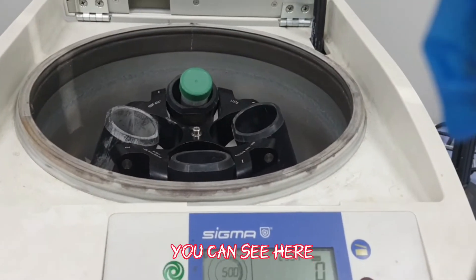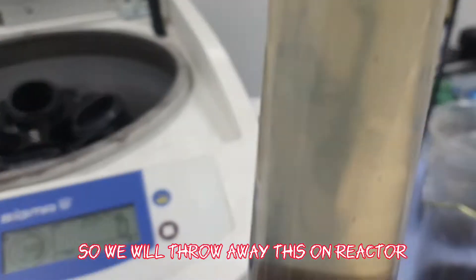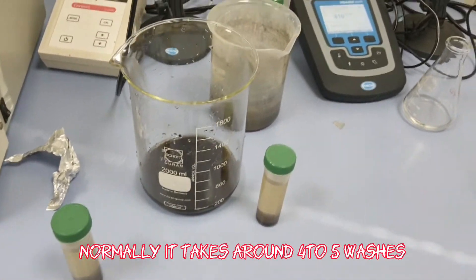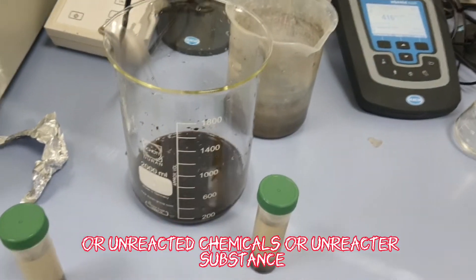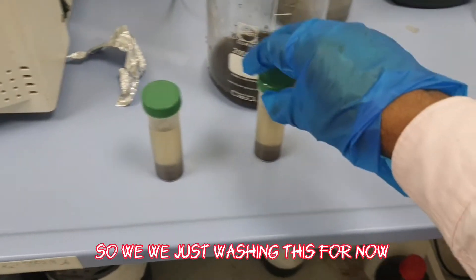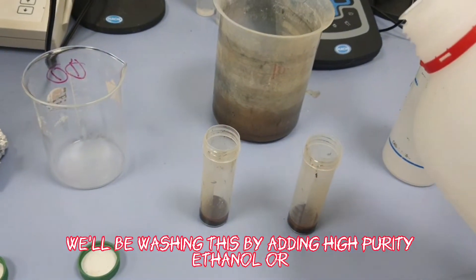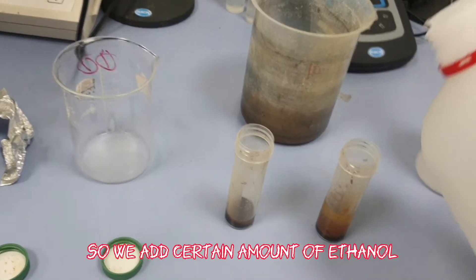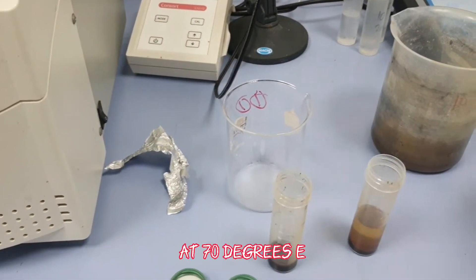After centrifugation, the product is clearly separated from the water. We discard the supernatant liquid and repeat the washing process — normally 4 to 5 washes are required to attain neutral pH and remove unreacted chemicals. In the last wash step, we add high-purity ethanol or acetone to remove any remaining impurities.